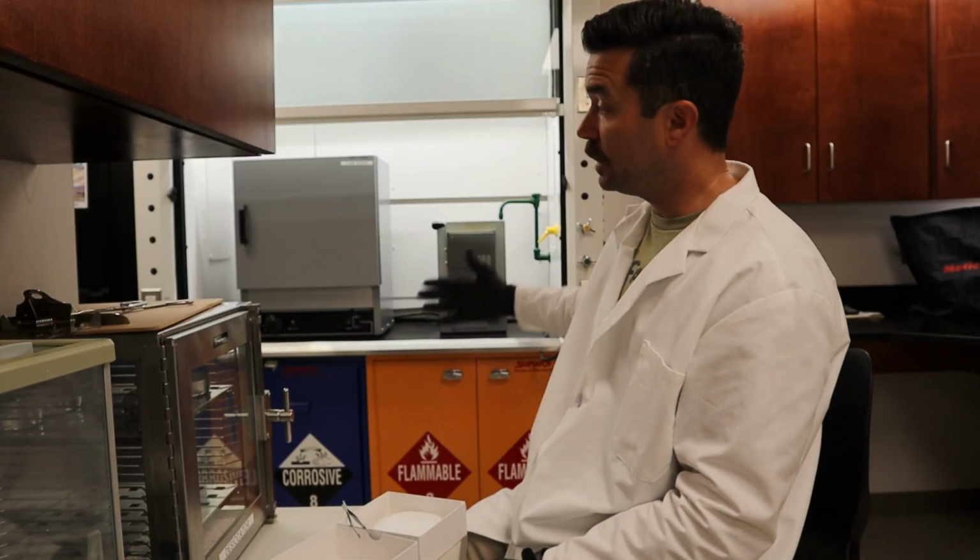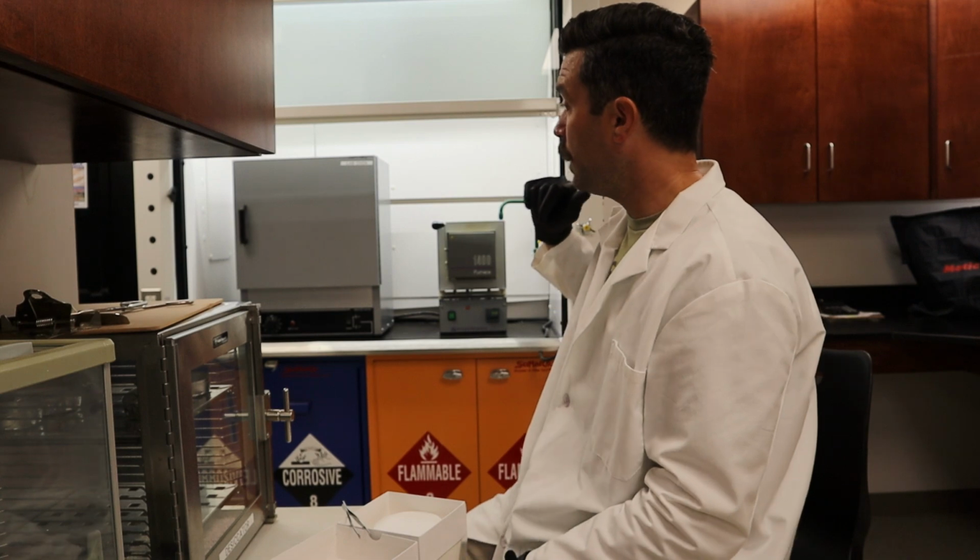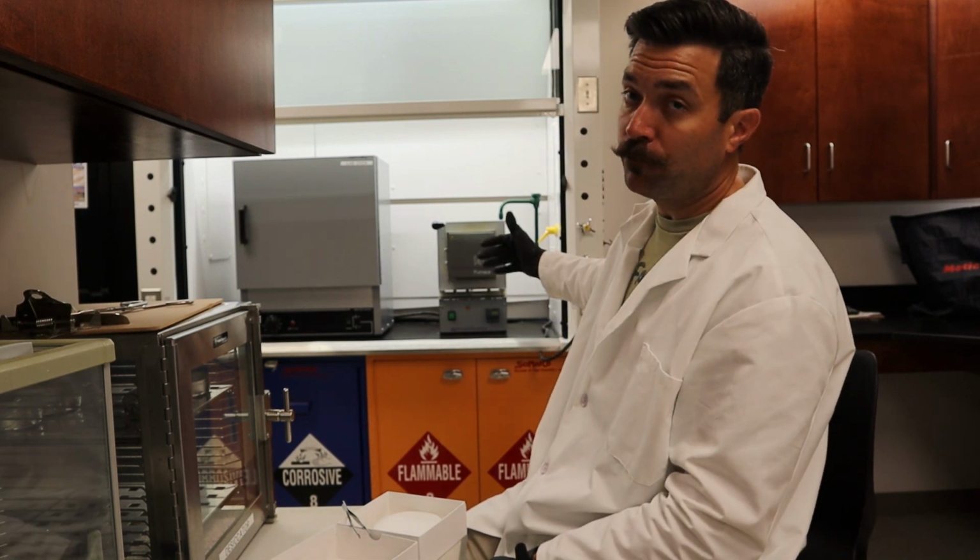Let's talk about a few other things we're going to need that you see behind me here. We have our lab oven and our muffle furnace.